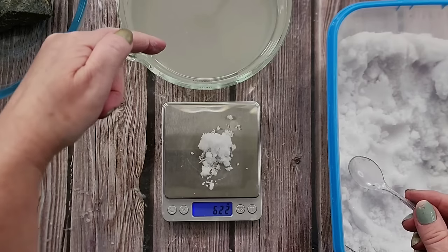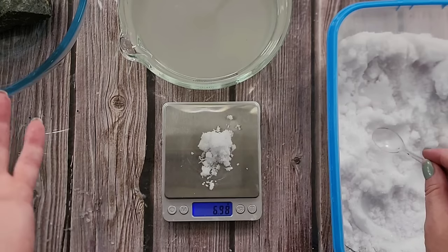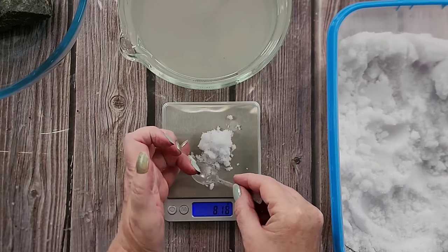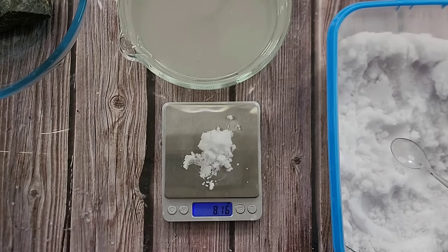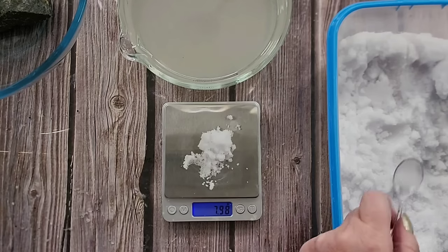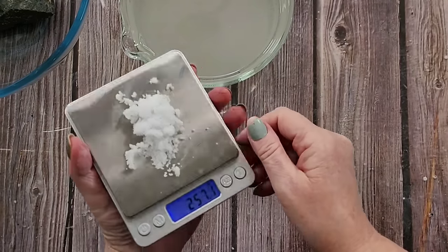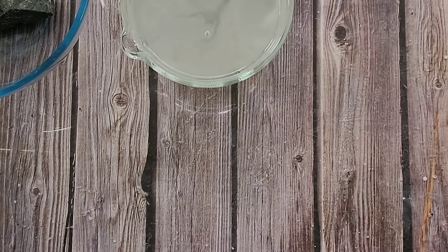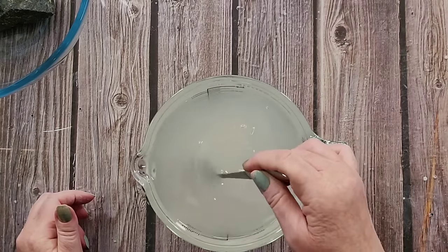When you're adding the alum, do it really slowly because one time I added way too much and once it's in you can't take it out. I'm going to go just under eight grams on my little scale — that's four already. Seven... eight point one eight — look at that, it's perfect! So that's the ADP and alum — that just goes in.